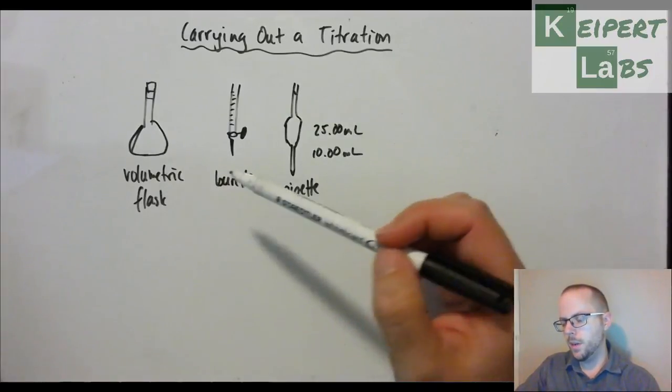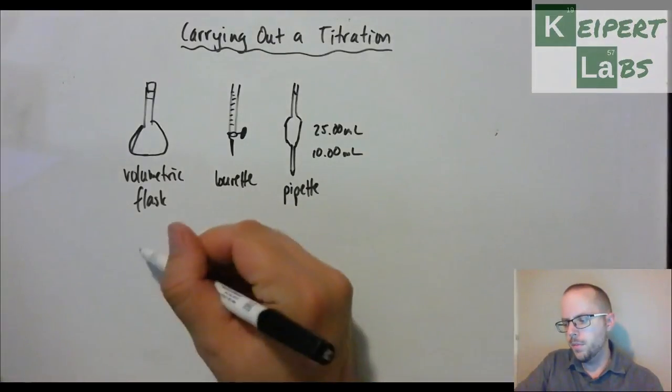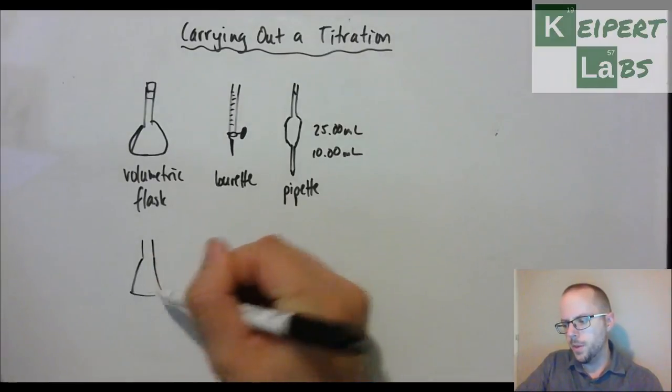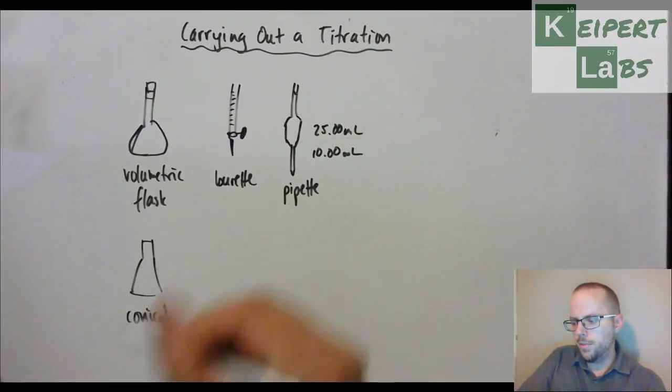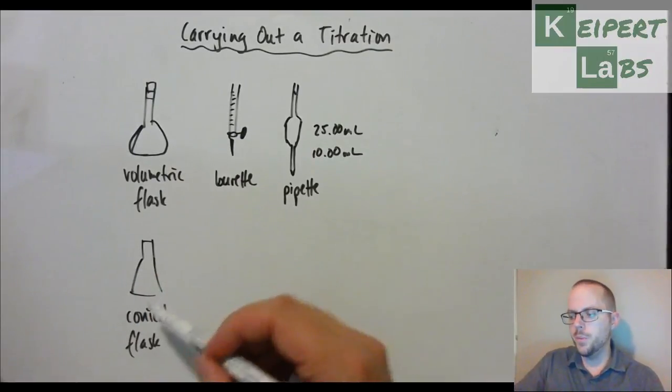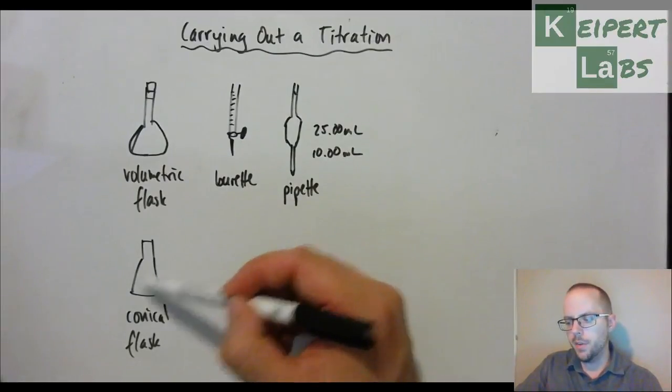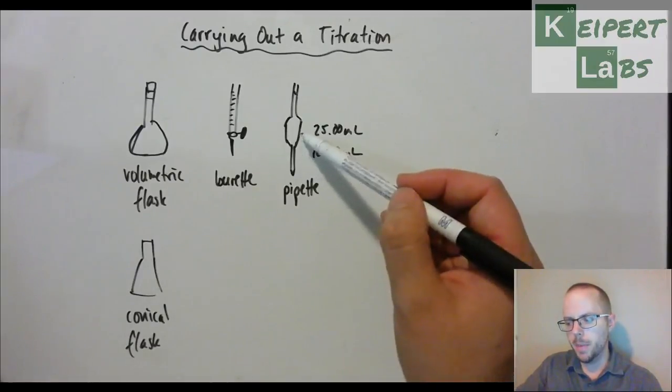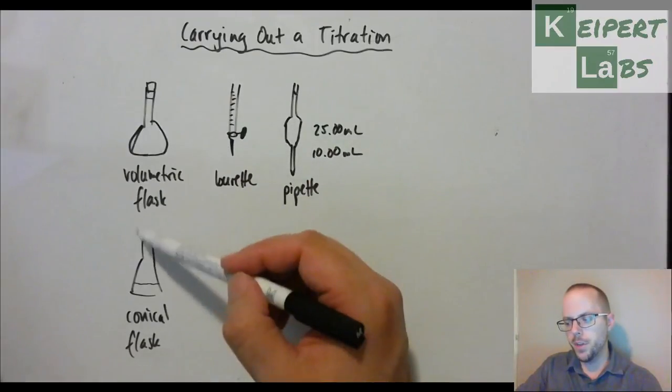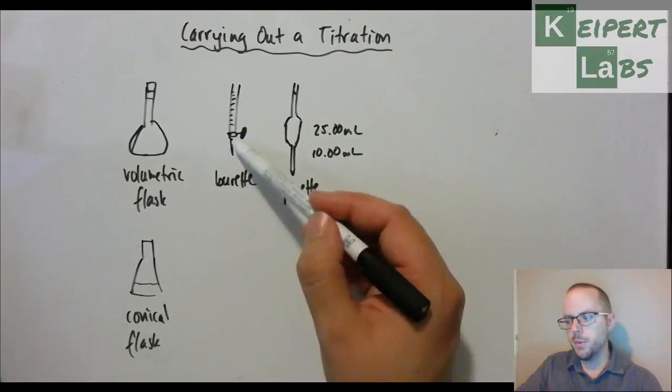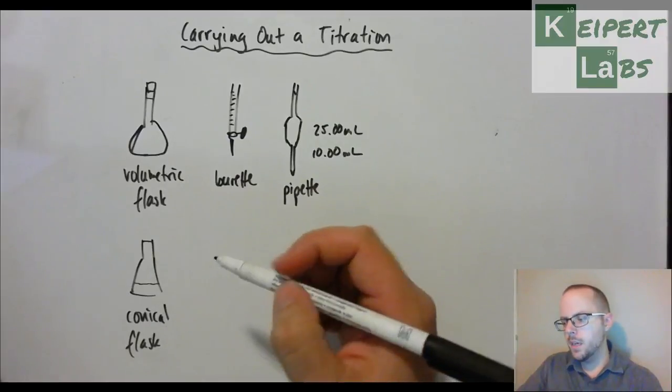So we've got a volumetric flask, a burette, and a pipette. Next we've got Old Faithful, hopefully a nice obvious one for you, our conical flask. We use our conical flask in combination with our burette to hold our two reactants. We've got one reactant in our flask and we've put a particular amount of it using a pipette in here. Then we put the burette and suspend it above the conical flask so that as we release the other reactant from the burette, it goes into the flask and reacts inside here.